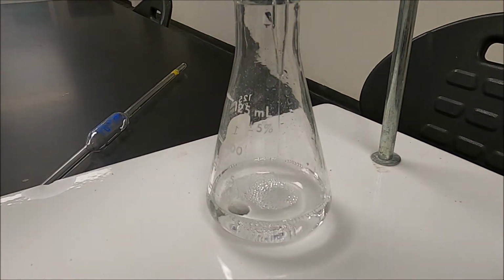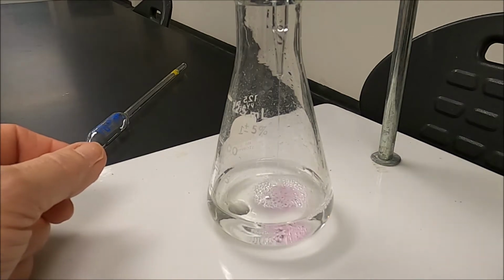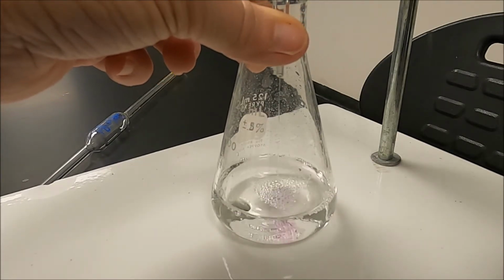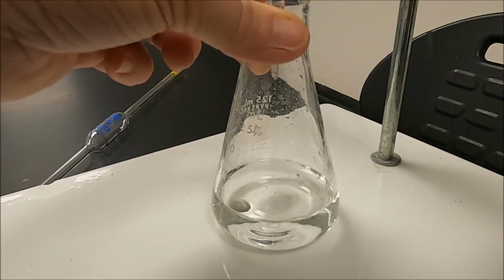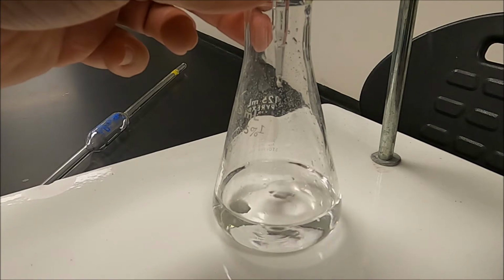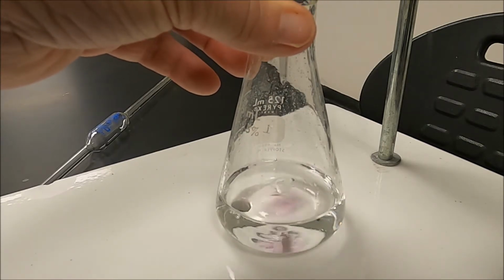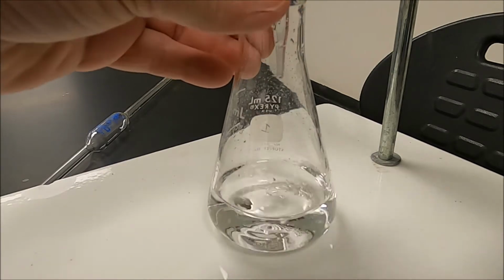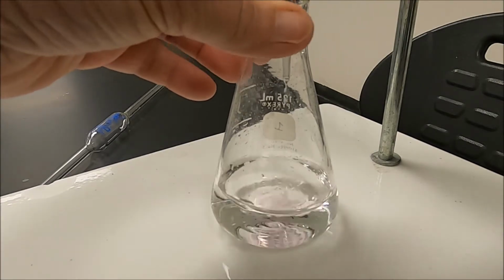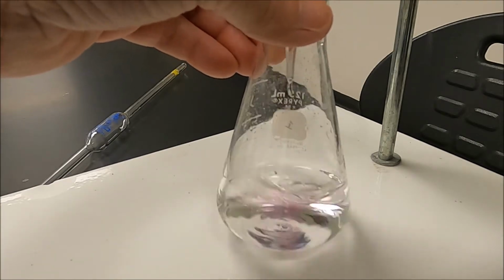So right now, no pink yet. I'm seeing some faint pink just where the base is coming in, okay? Notice how the pink is getting stronger. So I'm going to start swirling. See how the pink is showing up in there? It's getting more persistent. As it gets more persistent, I want to slow down the rate at which I'm adding the base, because I want to hit just that point where it turns pink and it stays pink. If I can swirl it and make the pink go away, I'm not at the end point.